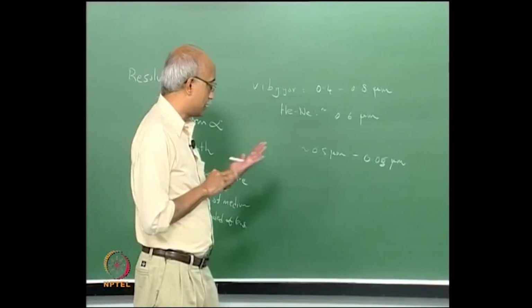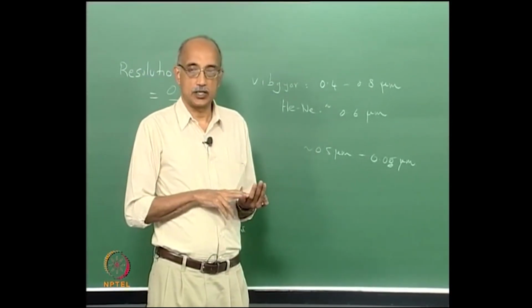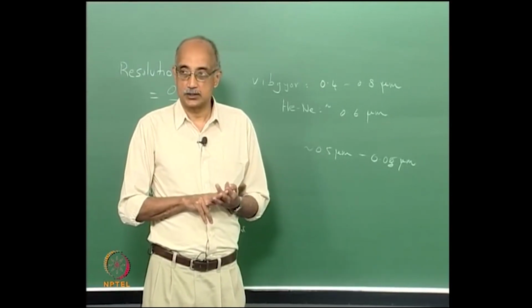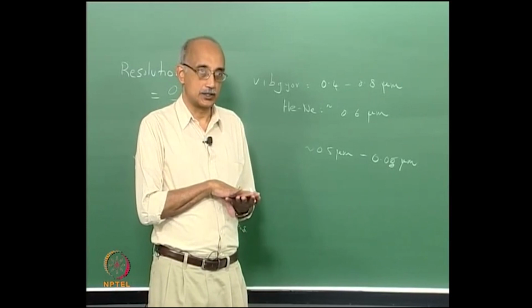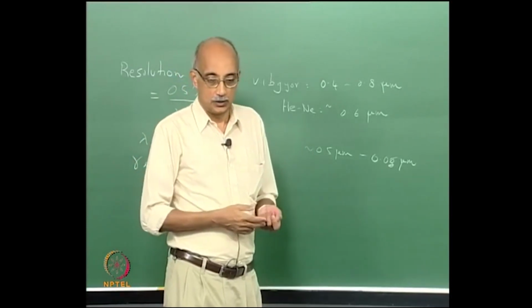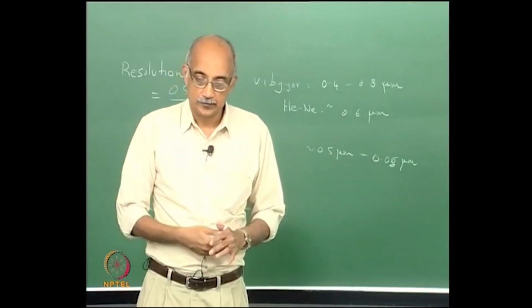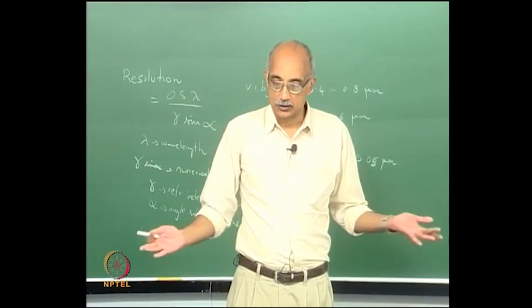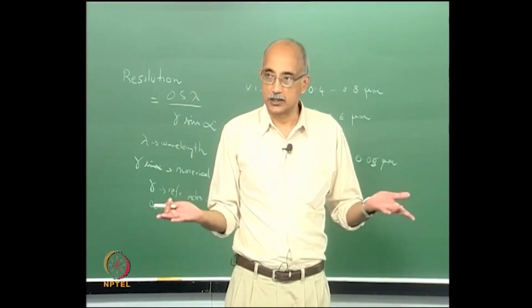The penalty that you always pay for higher magnification, higher resolution, higher sensitivity is the fact that the sample under consideration shrinks in size. So, for example, if I want to look at particles on this surface, if I were to use naked eye inspection, I can look at the whole surface within 10 seconds, right.